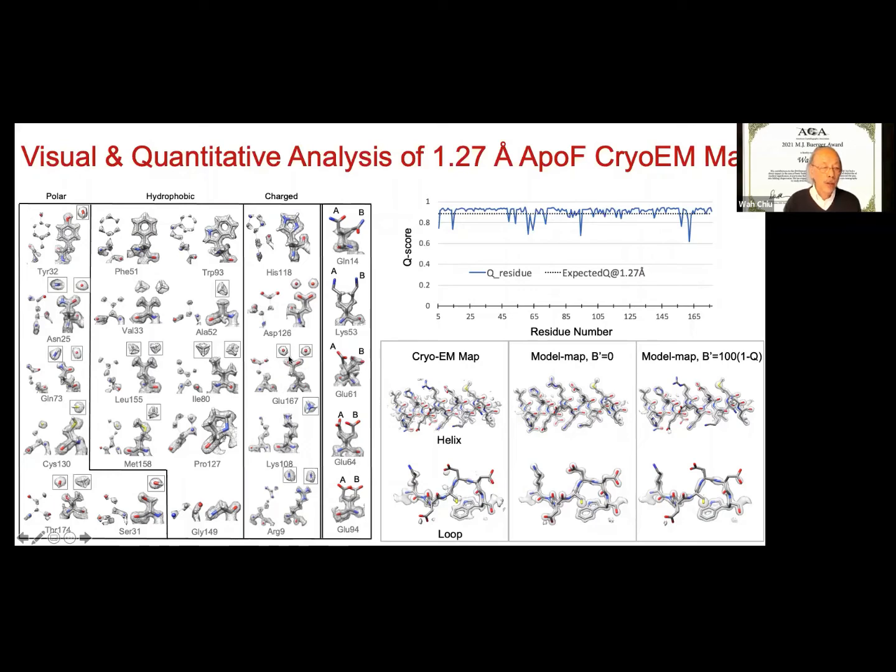So I think it probably has to do with the negative charge of this atom being absent in a lower resolution density map. And finally, we actually see there are a few of these residues that look like they have 2 different conformers.